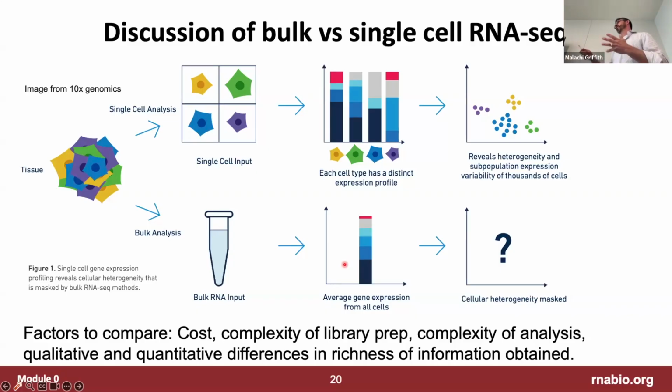And then if you're using the 10x platform, there is now Flex, which is relatively recent, that involves a fixing stage that makes the sample prep even more robust, so working from frozen or even FFPE. So I think it's mostly those kinds of sample quality concerns. But if you're particularly interested in the combination of RNA and epigenetics, there's also the multiome sequencing that does single nuclear RNA with single cell ATAC-seq. That works off of the nucleus approach, so you might do it for that reason. So I think there's a couple different reasons, yeah.